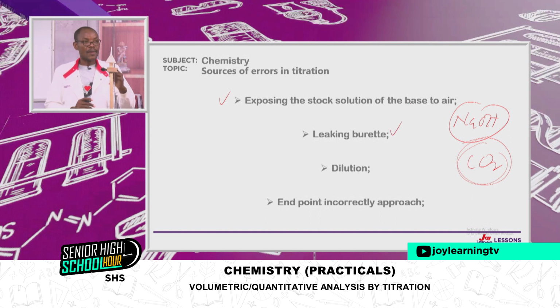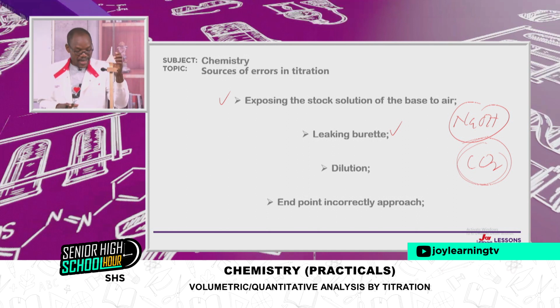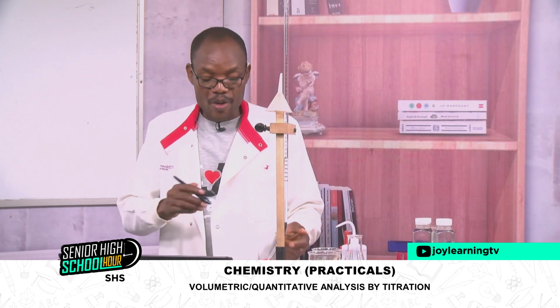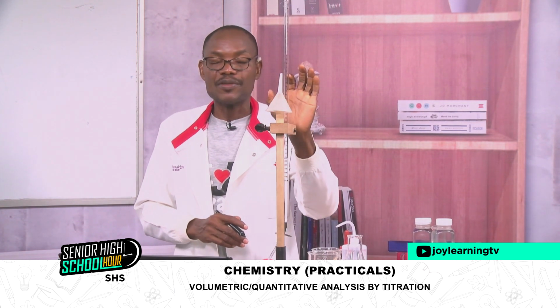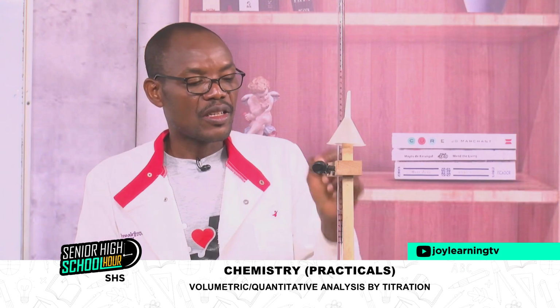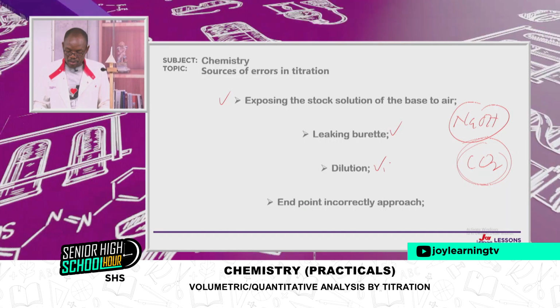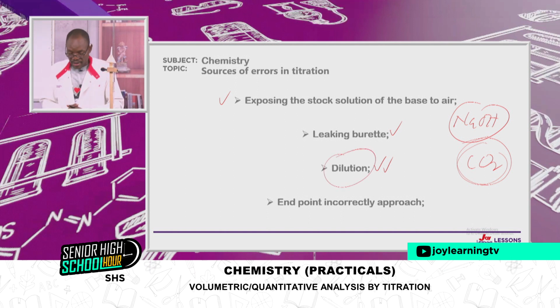You are using the burette and it is leaking. So it means that you take an initial reading. By the time you go to pipette and add indicator and start, it's leaking. So you have lost. Now you have written down the initial reading already, but where you are starting from is not it. So that will affect your final reading and it will affect the whole thing. When the solution undergoes a dilution, it can also affect your process.